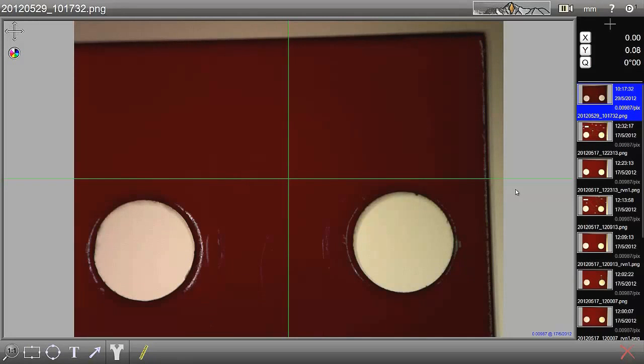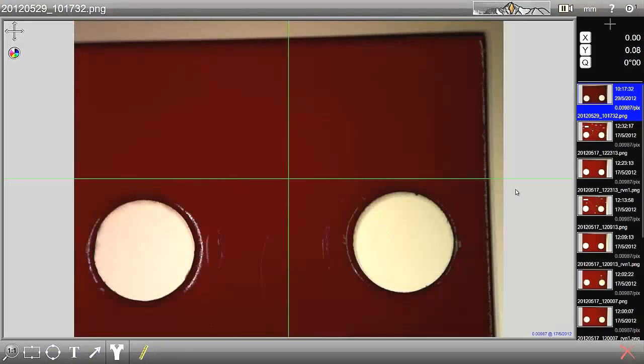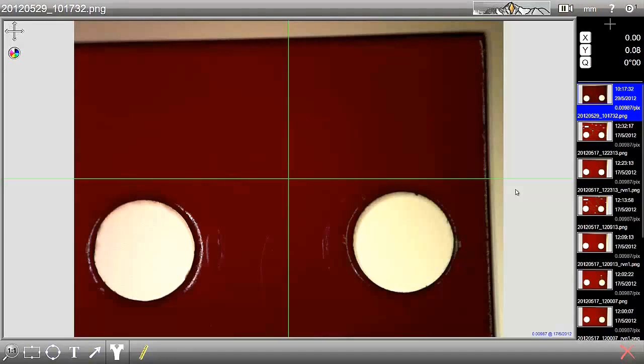This is a demonstration of Vision Engineering's new Dimension 1 package. This is a markup or annotation and dimensioning software. Let's have a look at the basic annotation and markup functionality. We have this image of a red block and we're going to annotate or markup some of the elements.